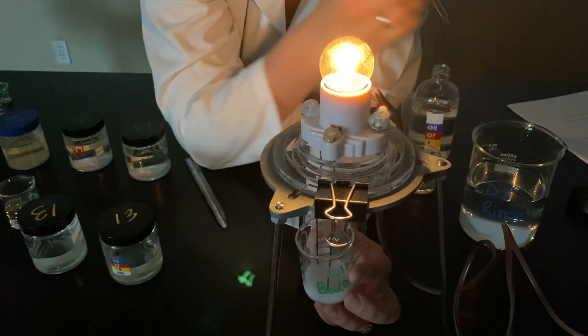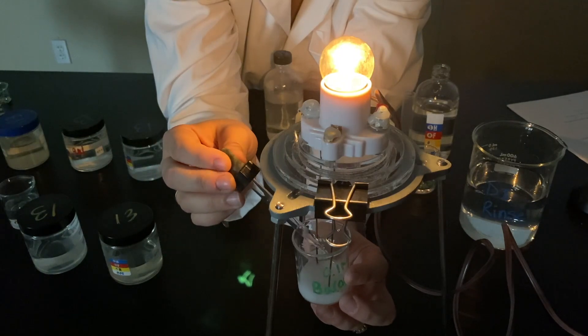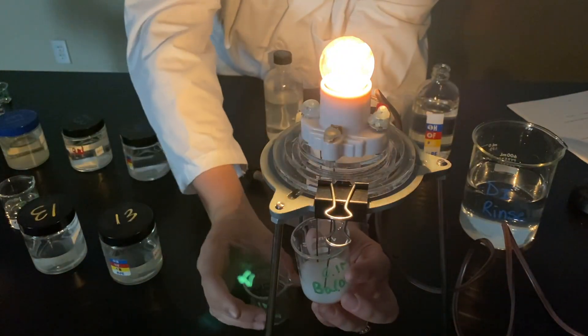Now you can see it's getting brighter again. The reaction was complete, and now I'm adding in more and more sulfuric acid. If I just dump the rest of the sulfuric acid in, it gets super bright again.